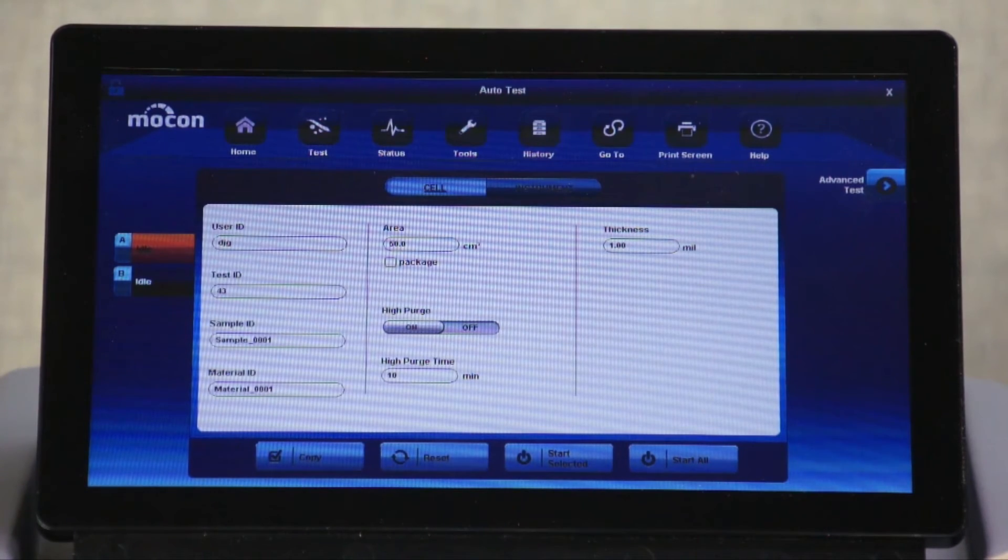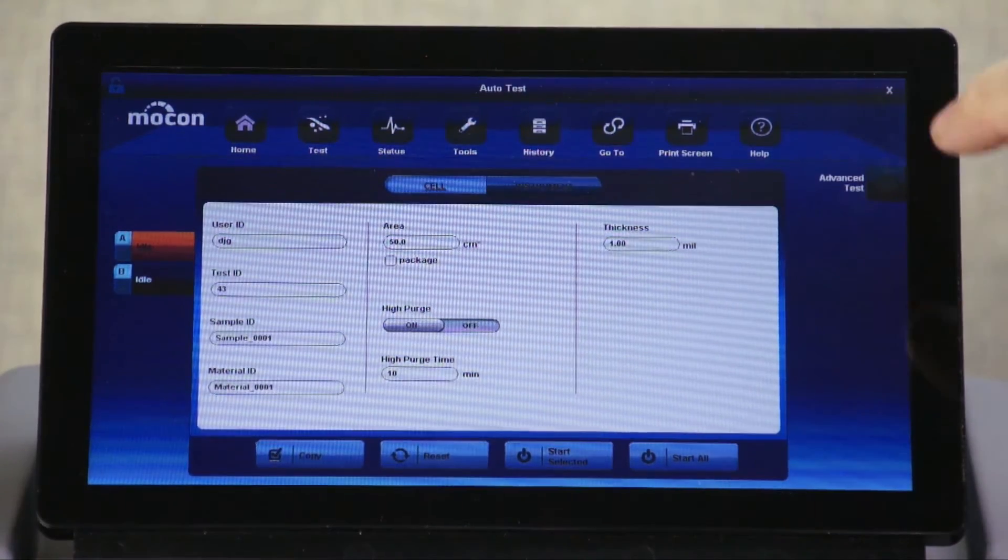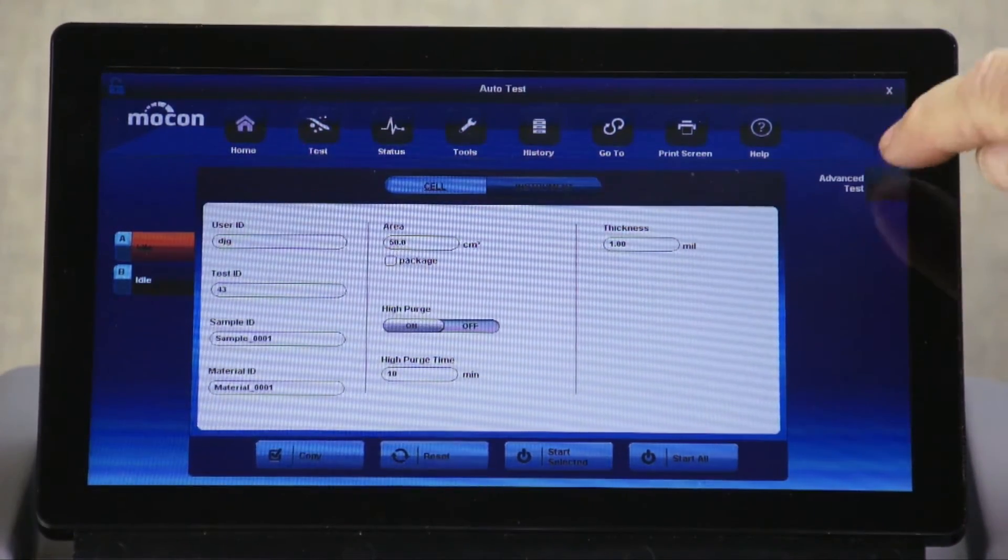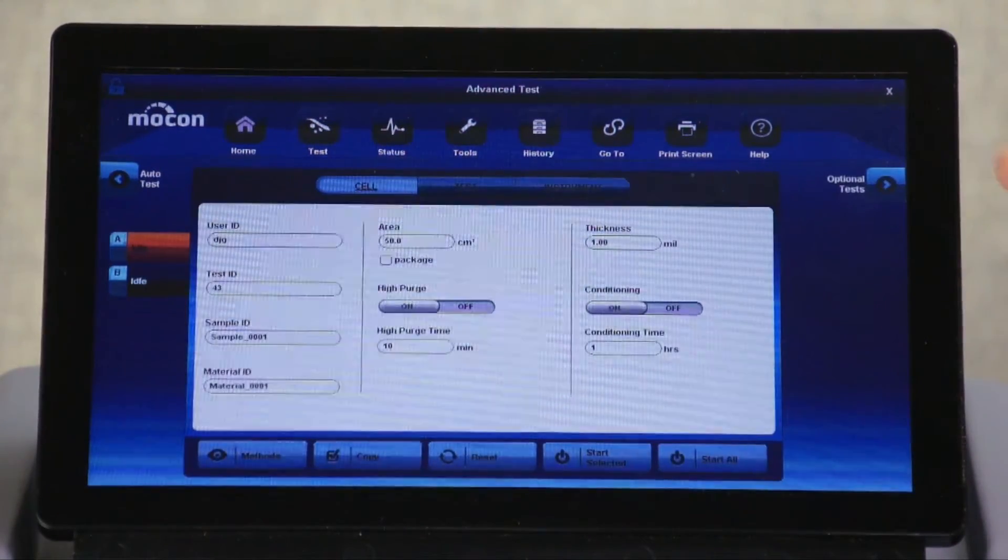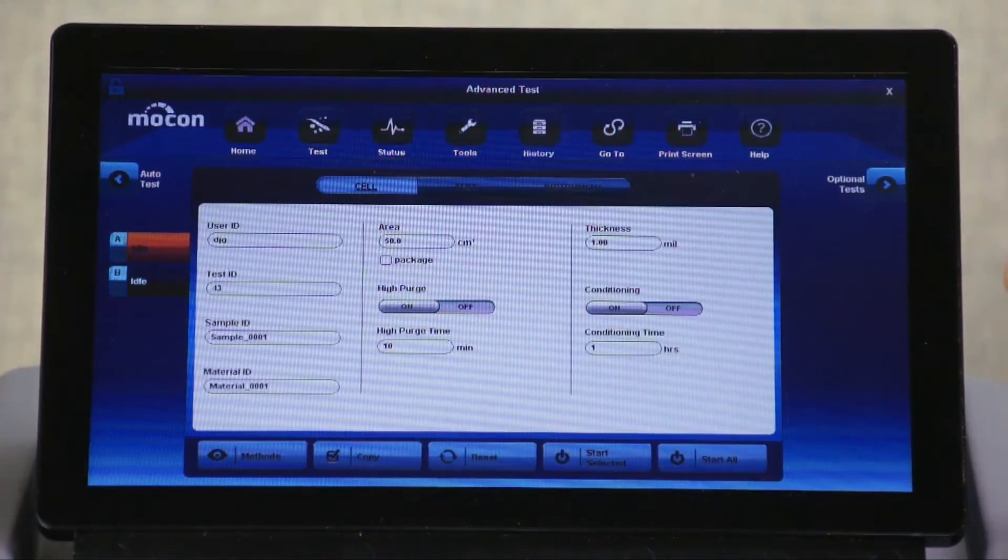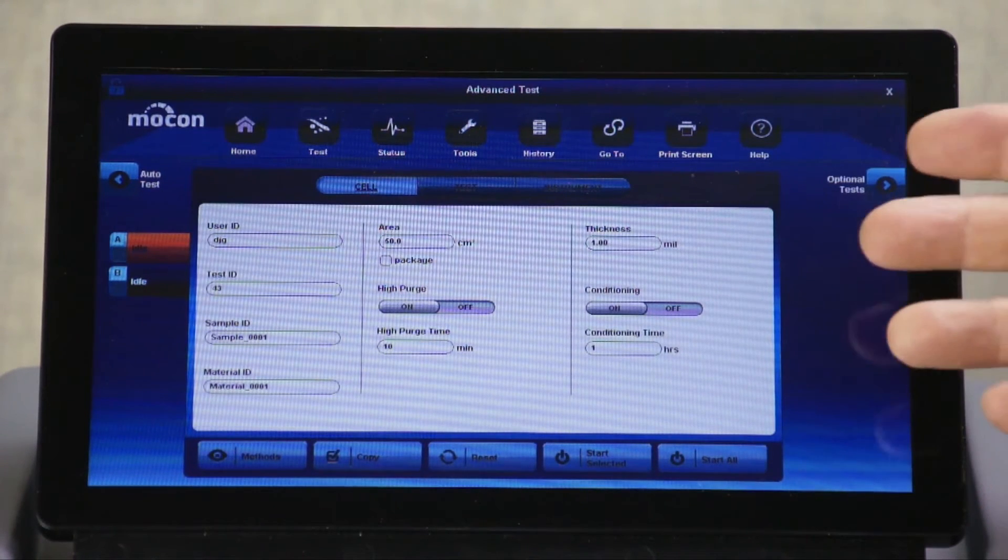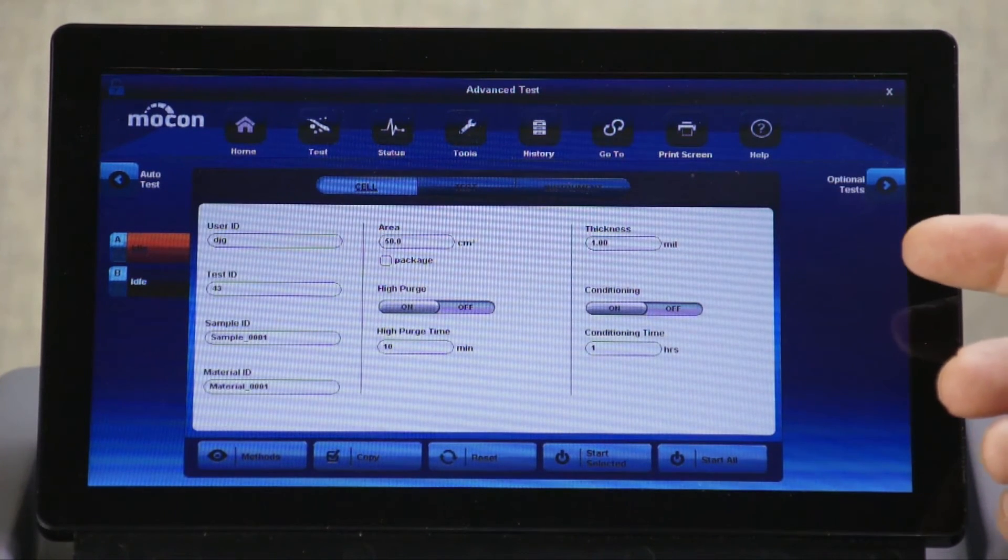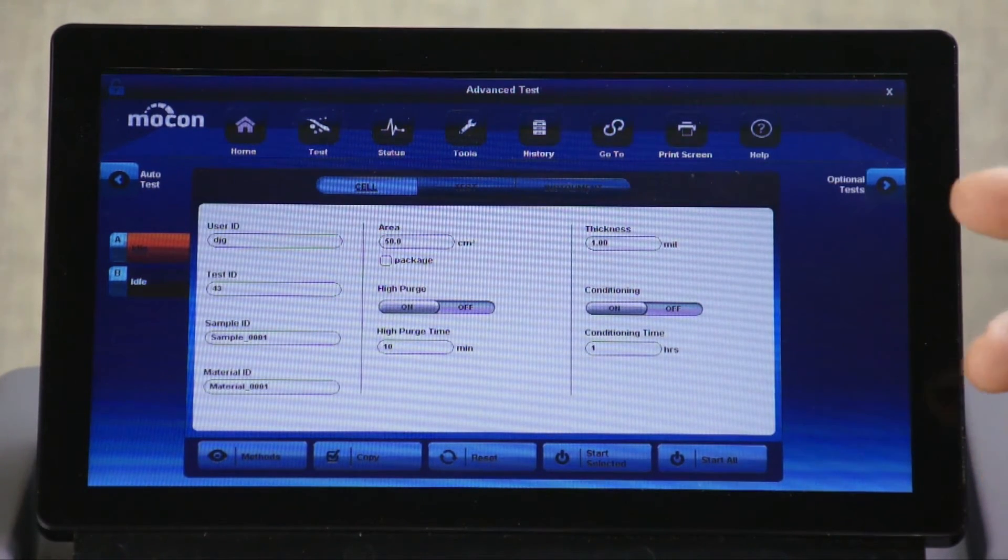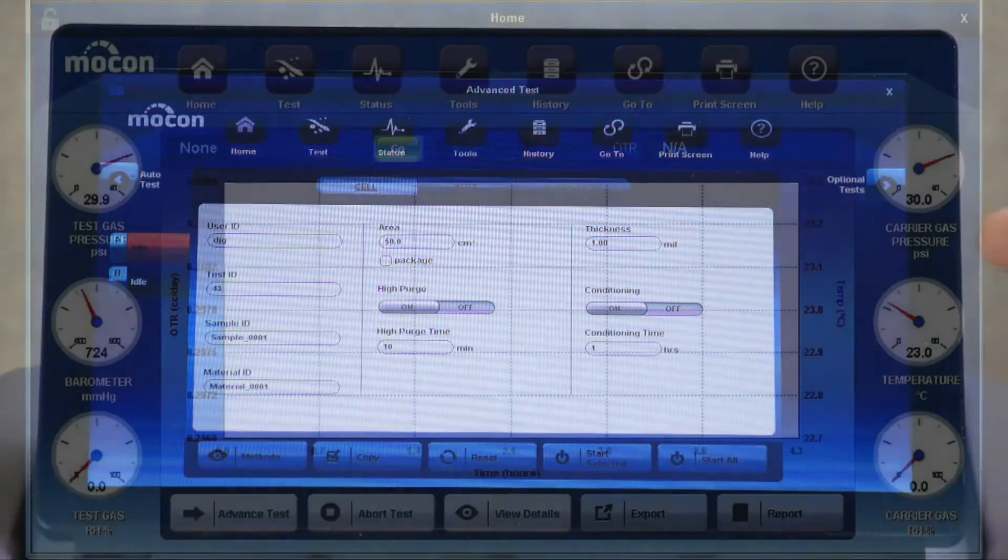Automatic mode also enables you to test film accurately when you don't know the film profile. Advanced testing mode is designed for those with more knowledge of permeation testing and allows for more flexibility. Advanced testing requires the operator to enter all test parameters.